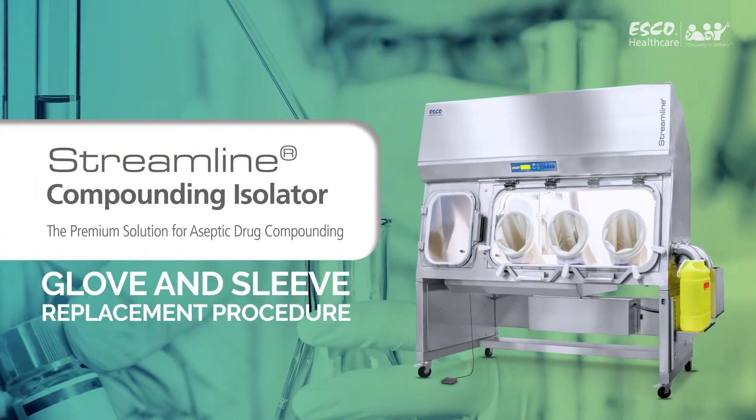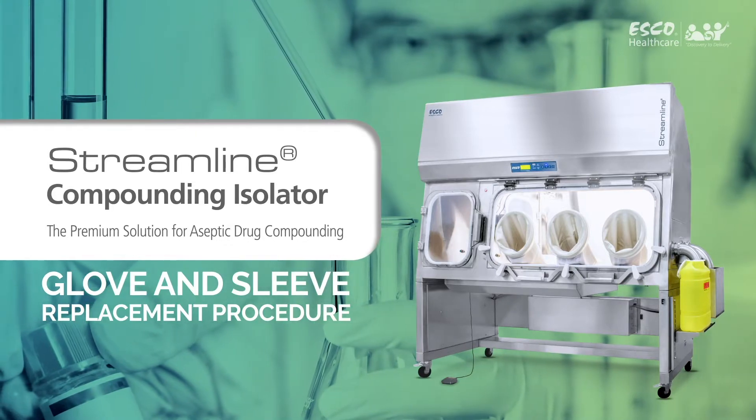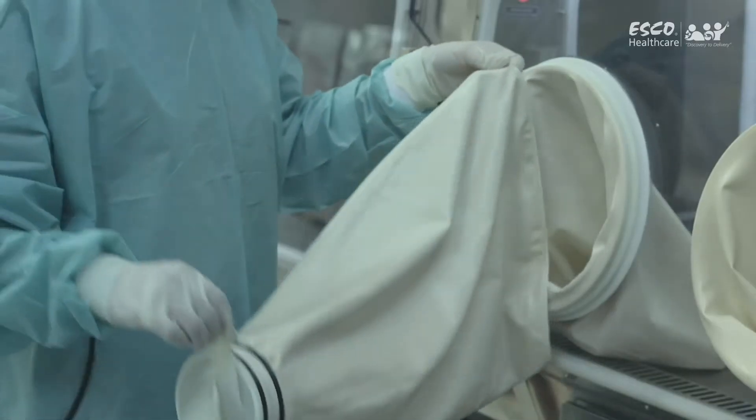Esco Streamline Compounding Isolator, the premium solution for aseptic drug compounding. This is a short demonstration on how to properly replace the gloves and sleeves of the Streamline Compounding Isolator.